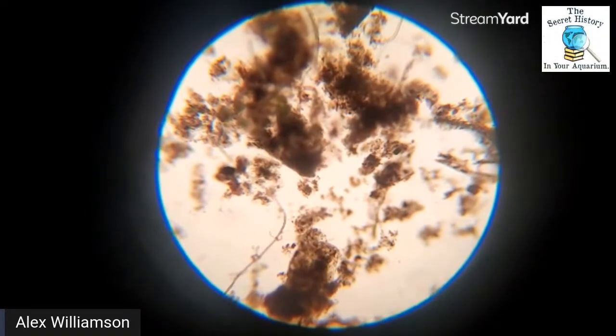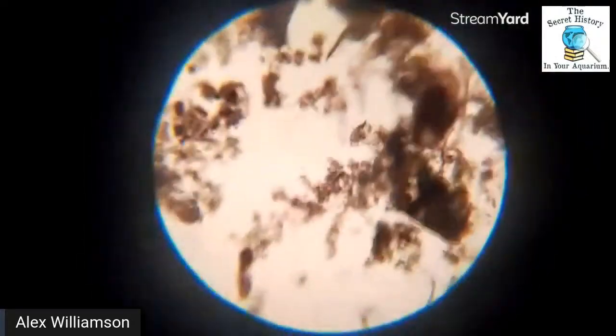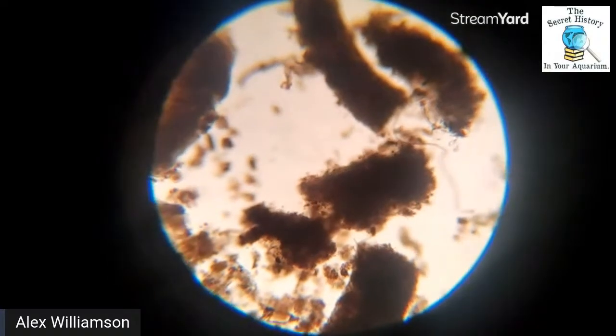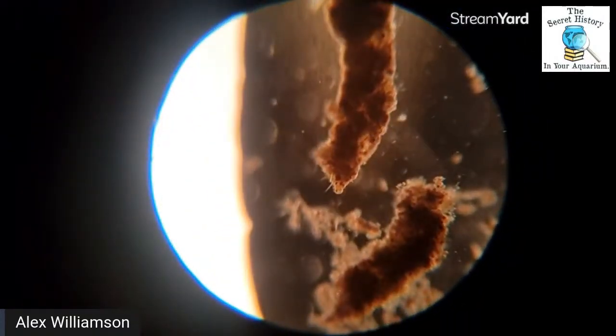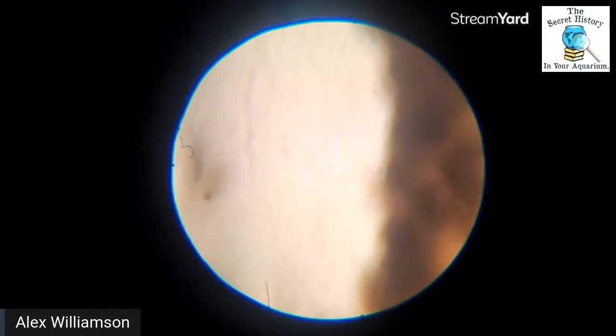You know, the ironic thing that people look at, and I always want to show them this, is I got all the mulm I could in these. Like, this is just big old globs of mulm. And yes, those are shrimp poop right there. That's how big we are at the microscopic level here. And we can get under different light and kind of see there's some other little life forms that are real small. Single cell stuff, if we zoom in here, we're zoomed in now 40 times.